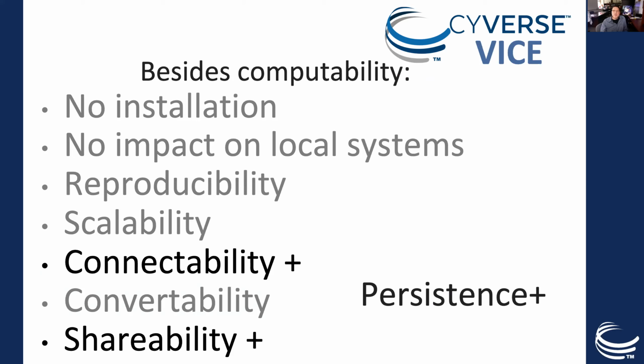And you also get better persistence because you can actually run the CyVerse version of this Vice app for 2 days without any problem. Whereas the Binder one, you're limited to only 6 hours, and you have to keep it active. If people have questions about that, we can talk more about that in the questions as well.